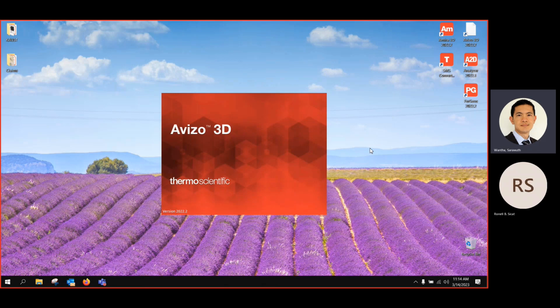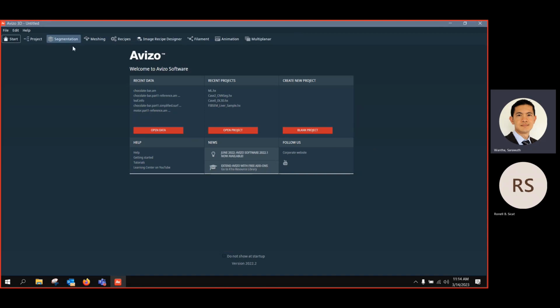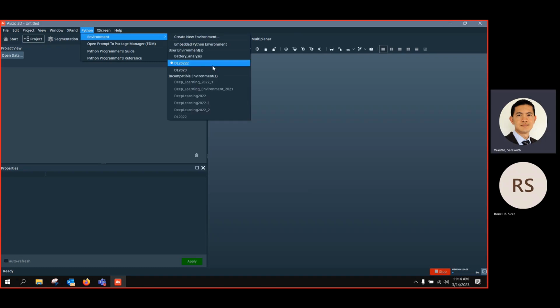So sometimes when you run some module and then they ask, this is not supported in the Python environment, you can think about it, it might be because of the environment that you selected. But since I've been running from the first day already, I have chosen the deep learning environment all the time, so it seems to be no problem with all the workrooms that I have.